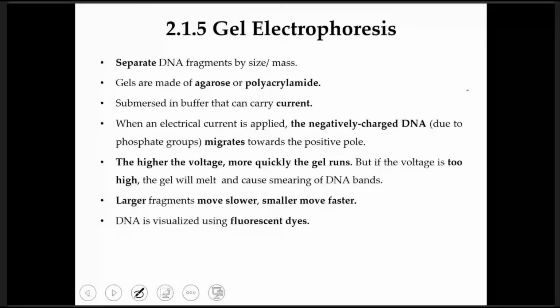So after you have increased your DNA sample, you will run the DNA through a method. We call it gel electrophoresis. Gel electrophoresis is a method to analyze your DNA by producing various patterns of DNA bands. Yesterday we looked at DNA fingerprinting, how to get the DNA fingerprinting: you run your sample through this process, gel electrophoresis.